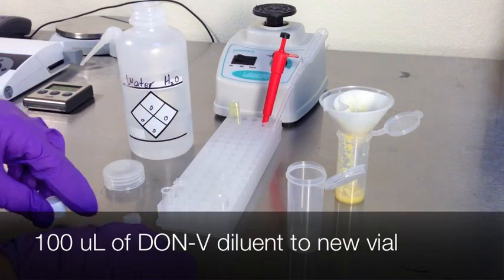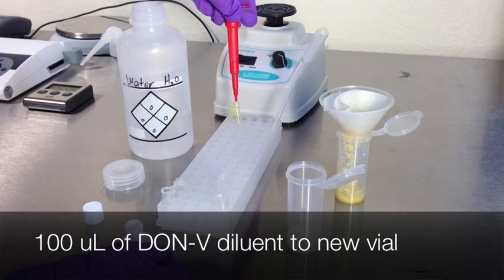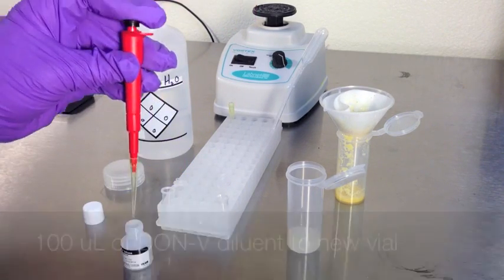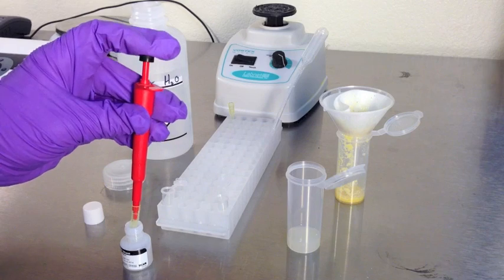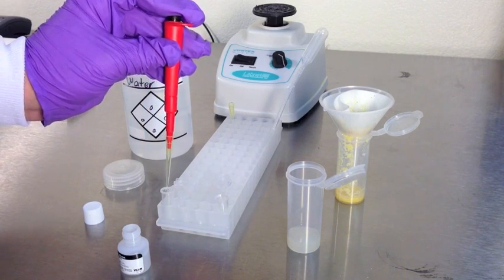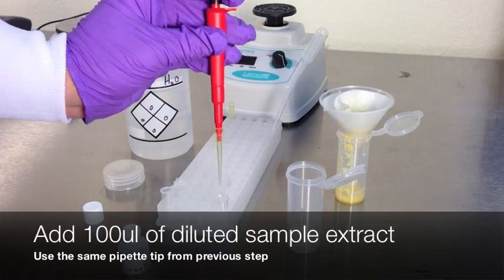Transfer 100 microliters of Don V Diluent to a new disposable strip test vial. Using the same pipette tip, transfer 100 microliters of diluted sample extract from the first vial. Then mix well by vortexing.